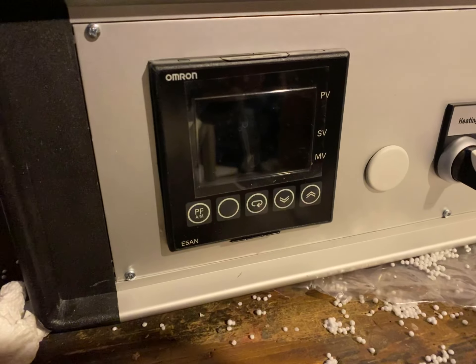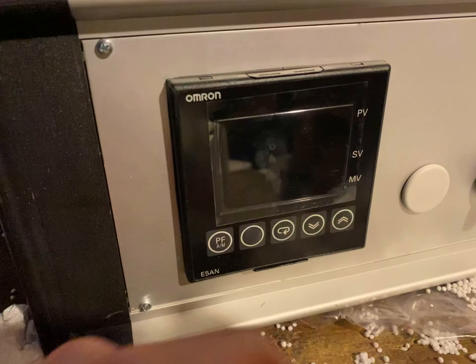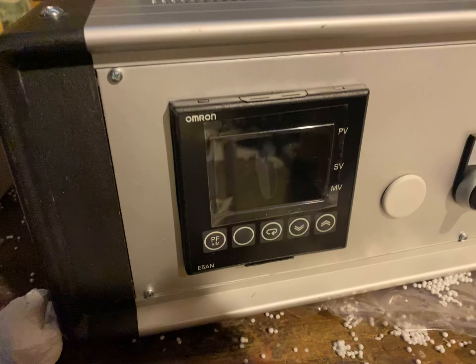We have an Omron temperature controller. You just go through the settings — there's some simple software to turn the heat up or down to establish the right temperature.